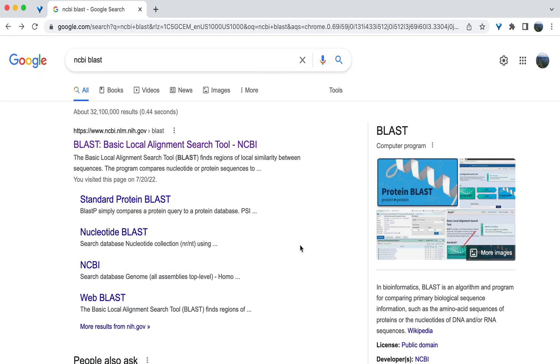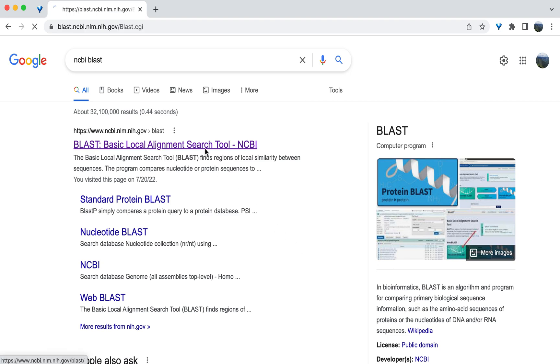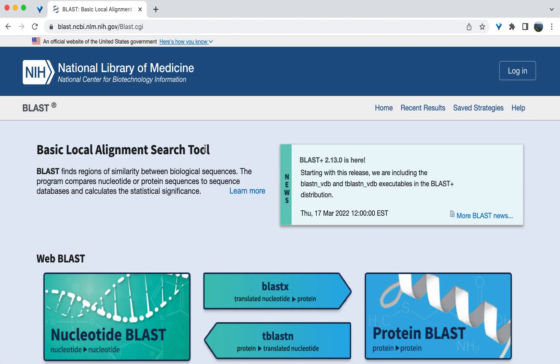Then to start the comparison of the amino acid sequences, navigate to NCBI's BLAST website on your browser. From BLAST's main landing page, select Protein BLAST on the right.